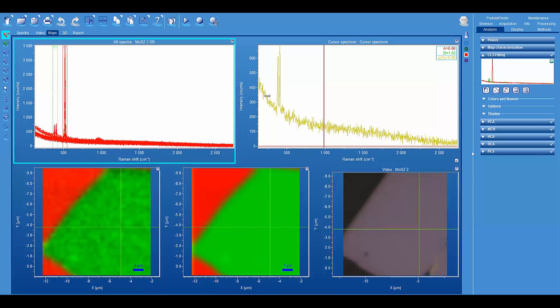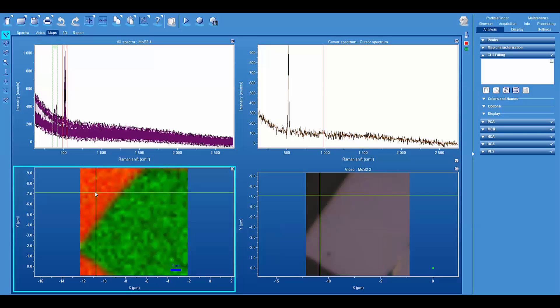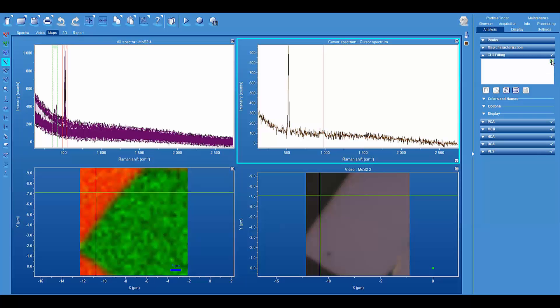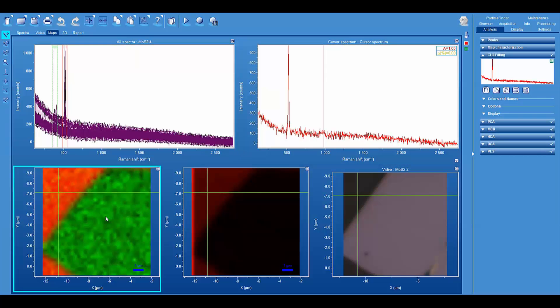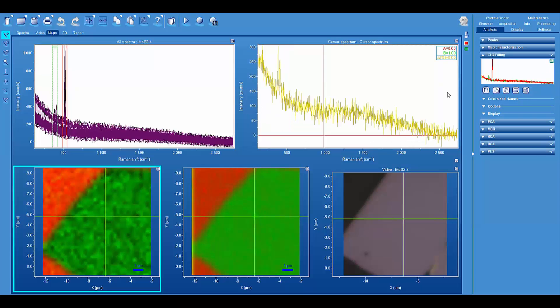And let's drop it down now to 10 milliseconds. So we went from 1 second to 100 milliseconds. And now we have 10 millisecond per point integration time. So we're starting to reach the probably the limits of what we're able to do with this particular material system. Nevertheless, as we see that the signal to noise has been dropping, of course, with the decreased integration time, we can still, based upon the entire spectrum and using classical least squares, we can generate our images based on the spectral contributions. And now we click on the molybdenum disulfide component. And so here then is our classical least squares image in the middle for a 10 millisecond per point integration time.